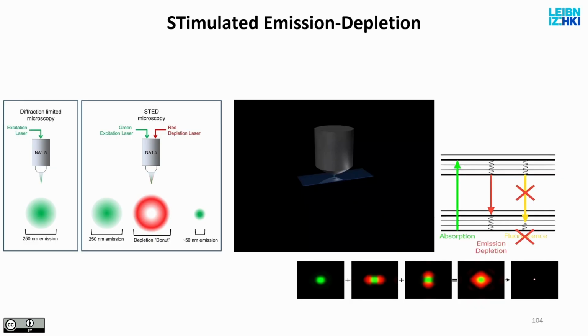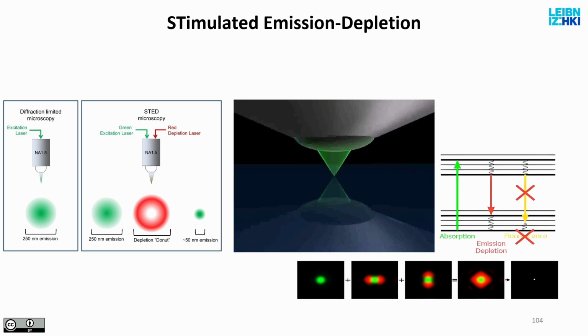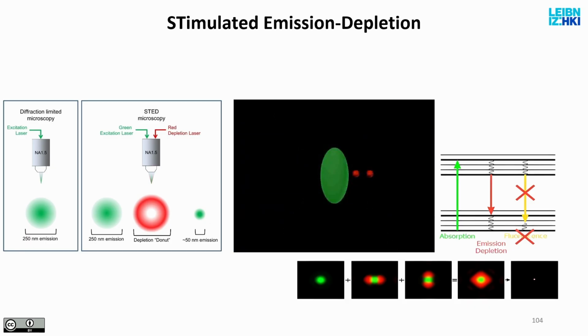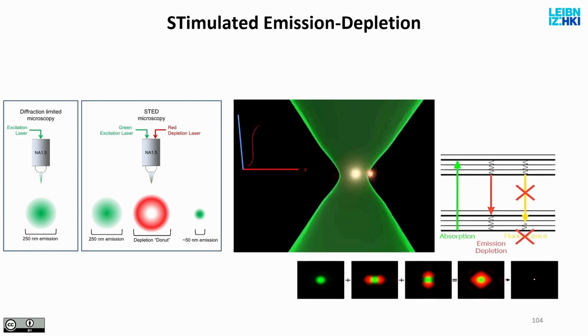So here comes the idea from Professor Hell and others, who got the Nobel Prize like 10 years ago for this: stimulated emission depletion. And this means the following. Instead of using one laser spot, like we use for fluorescent molecules, I use two. I use the original, what I need for fluorescence, but I also generate a laser beam at a higher wavelength, which looks like a donut.